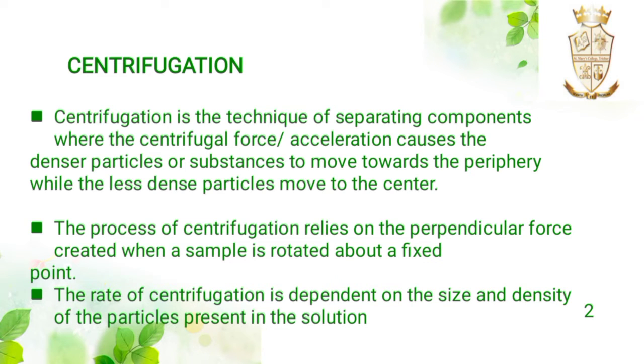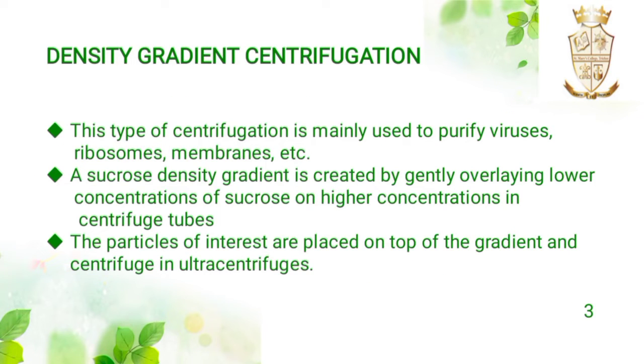More simply, centrifugation is the technique of separating components where the centrifugal force acceleration causes the denser particles or substances to move towards the periphery and less dense particles to move to the center. The rate of centrifugation is dependent on the size and density of the particles present in the solution.